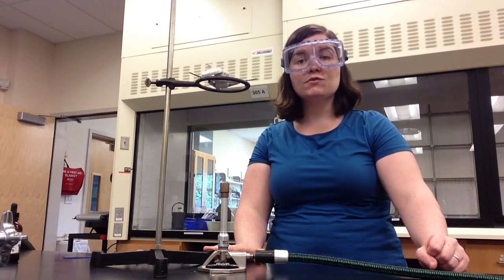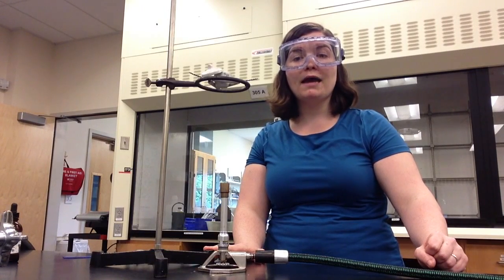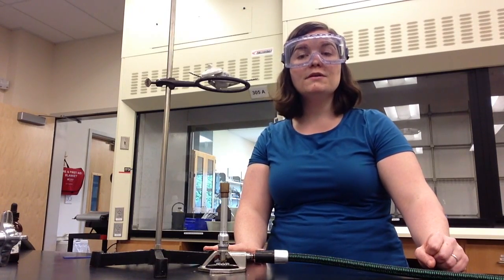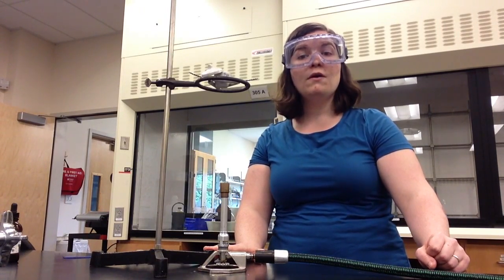Before you leave, clean, dry, and put all equipment back where you found it, whether it's a cart, your box, or a shelf. Wipe off your lab bench and wash your hands. Remember that a safe lab is a happy lab.